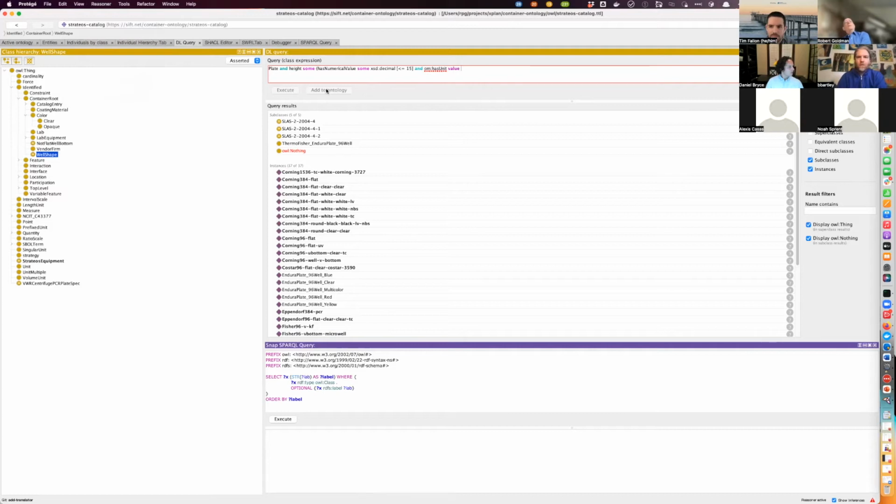Oh, and by the way, one of the things that Protege will let you do, which is kind of handy, is, once I've figured out this query, and I agree, I didn't get it very well, but I've got this query here, I could take that and give a name to it and stick it in the ontology as a way of remembering the description of a short microplate or a microplate that's compatible with this plate reader. And that's kind of a useful utility.